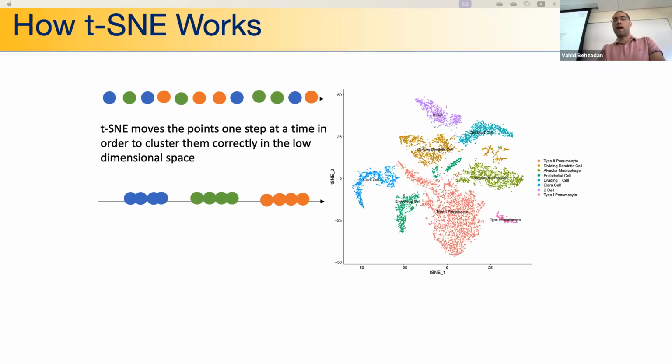Okay, so after that, you can use different methods. Basically, you can use Euclidean distance, right? Because each dot is basically a cell, right? So you can use simple Euclidean distance. Is there some form of embedding?